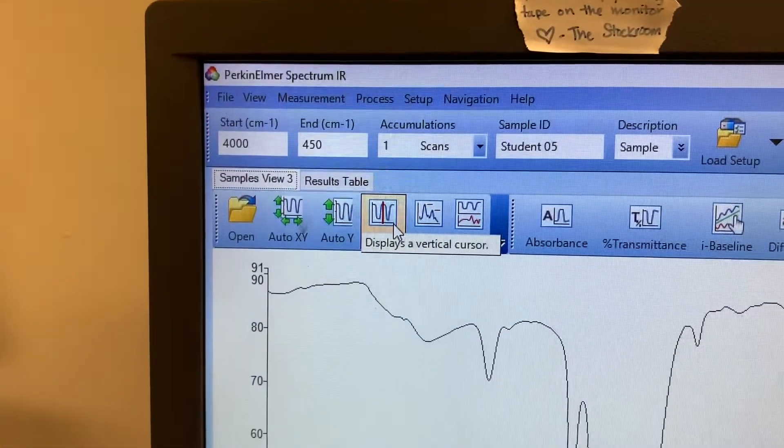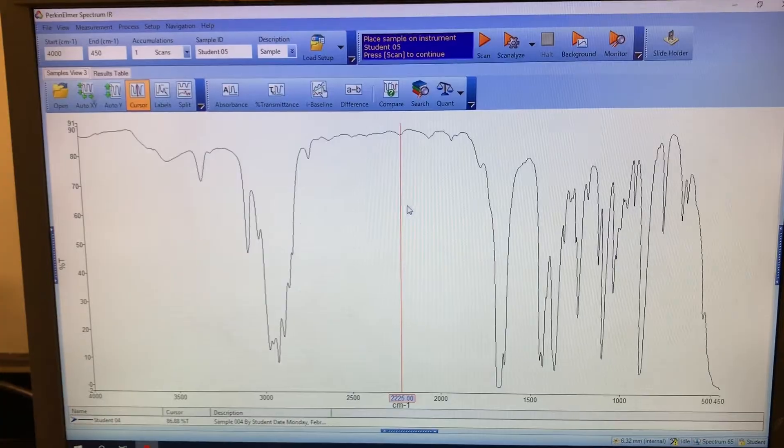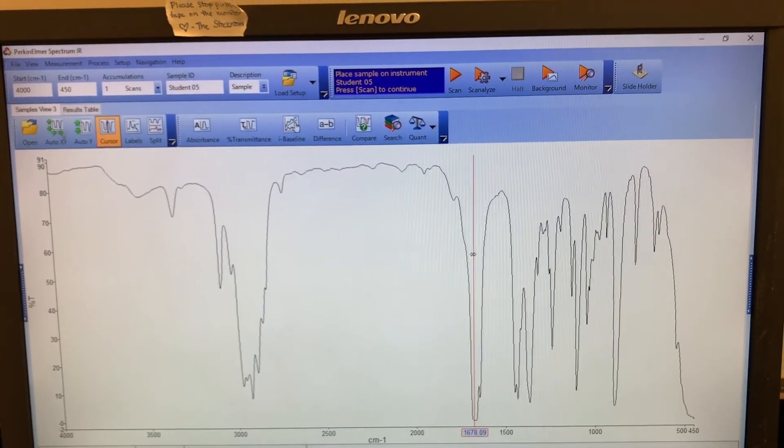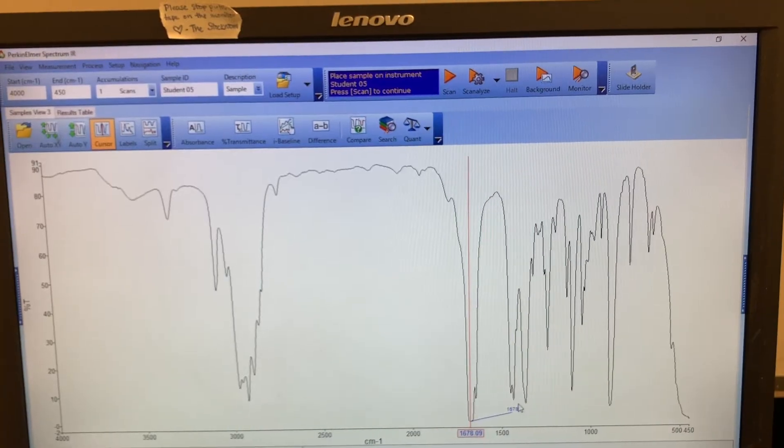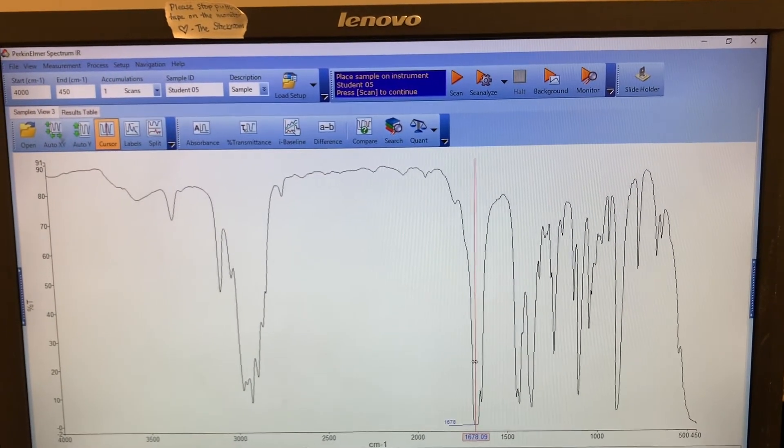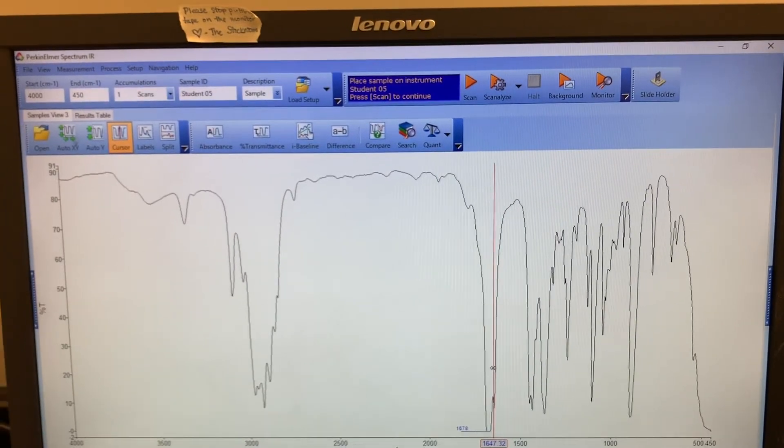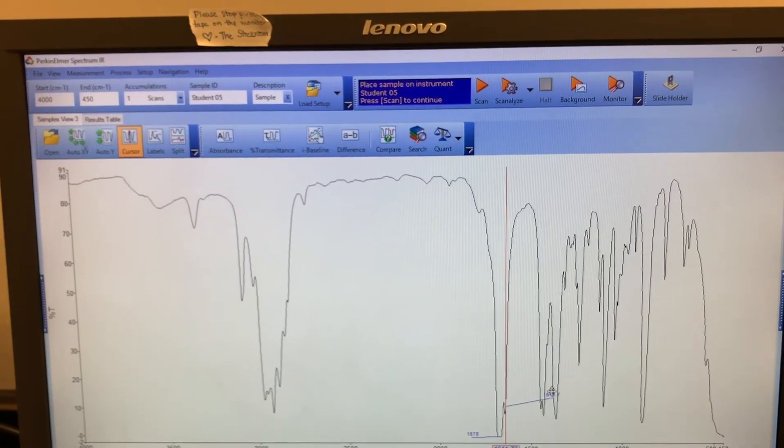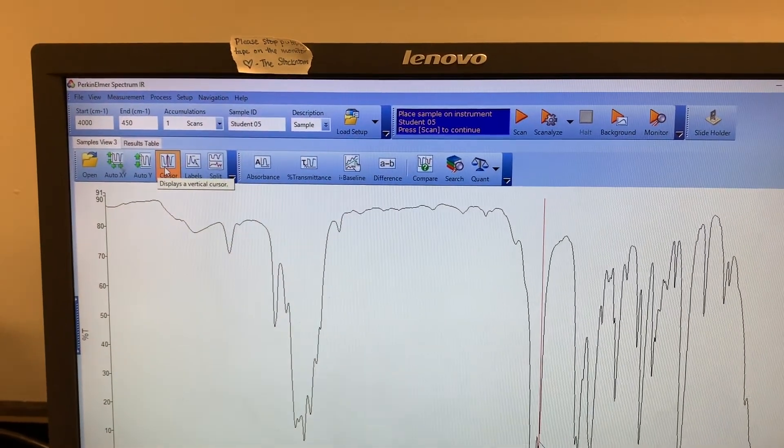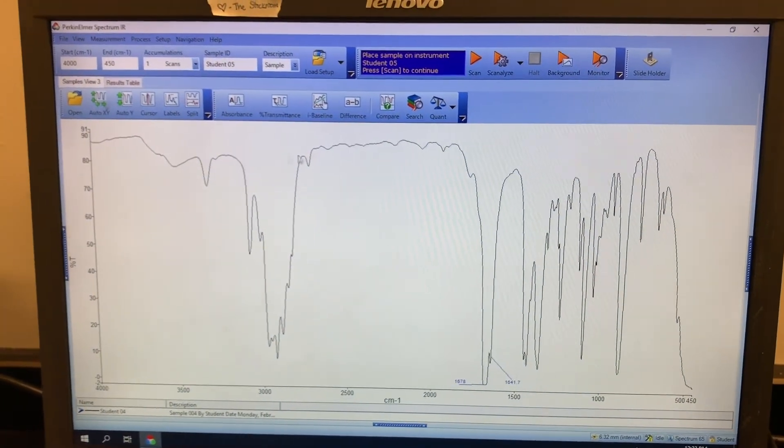Instead I'm going to go to this cursor button. This gives me this nice little line here so I can bring it over to that carbonyl peak. If I double click, I get a number. I can drag it over to a nice place, I can drag it over to this next little peak, double click. Those numbers overlap, so I'll just put it right there. To get rid of that cursor, you just hit cursor again, and that's how you get your spectrum.